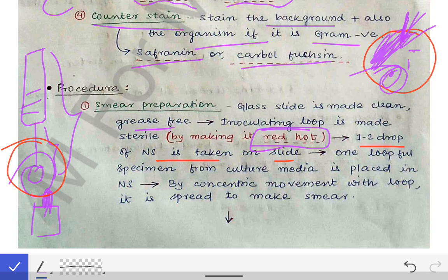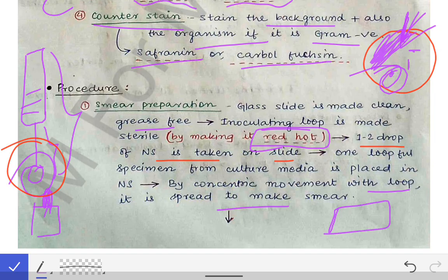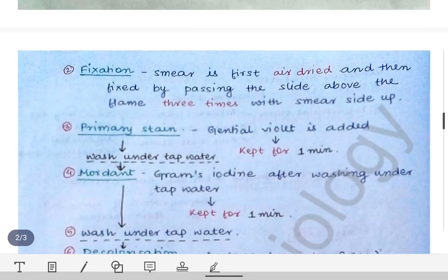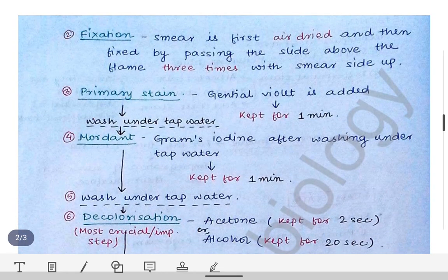We take the single discrete colony and add it over the normal saline already placed on the glass slide. We mix it with a concentric movement using the inoculating loop, then spread it over the glass slide to make a smear.